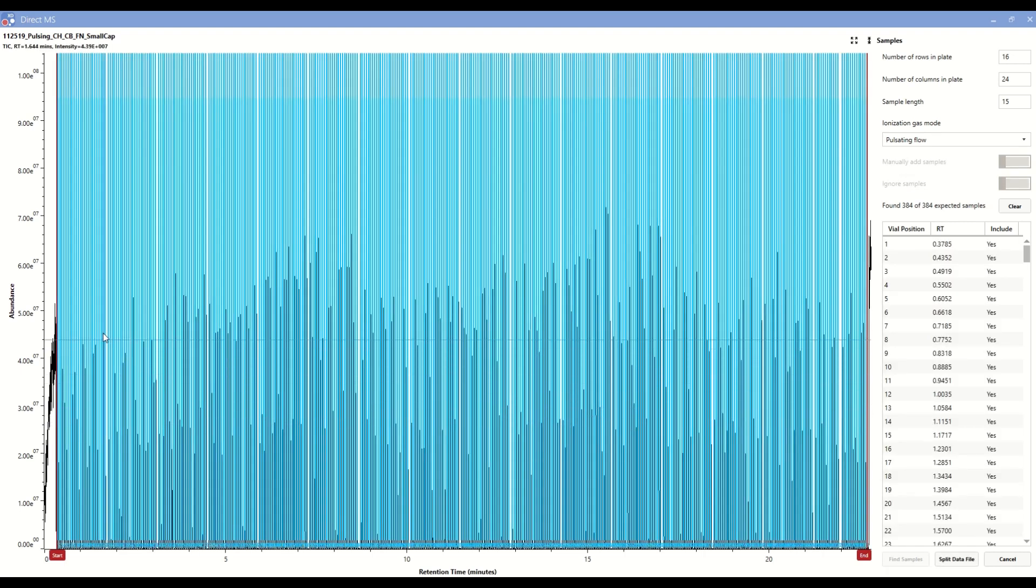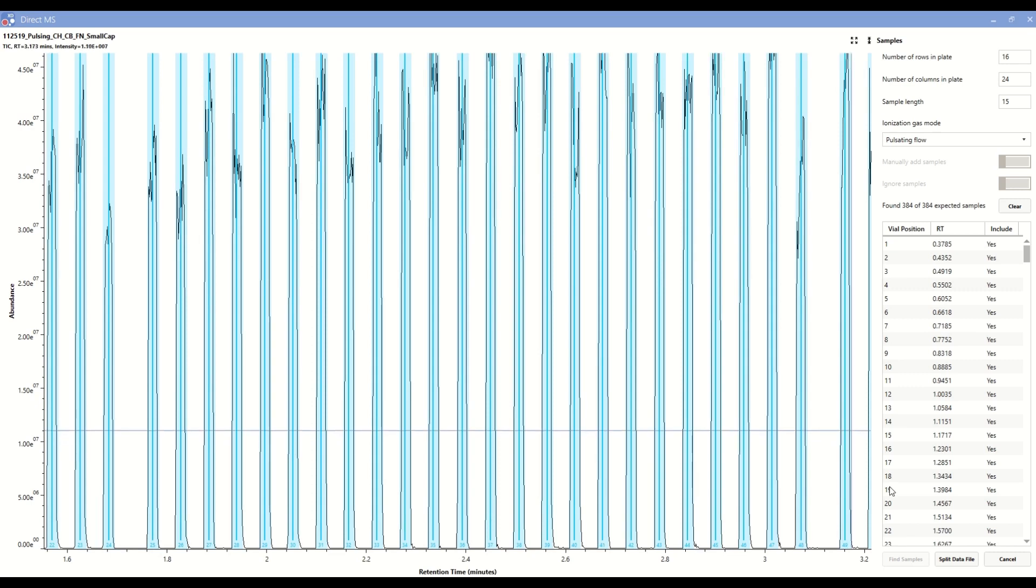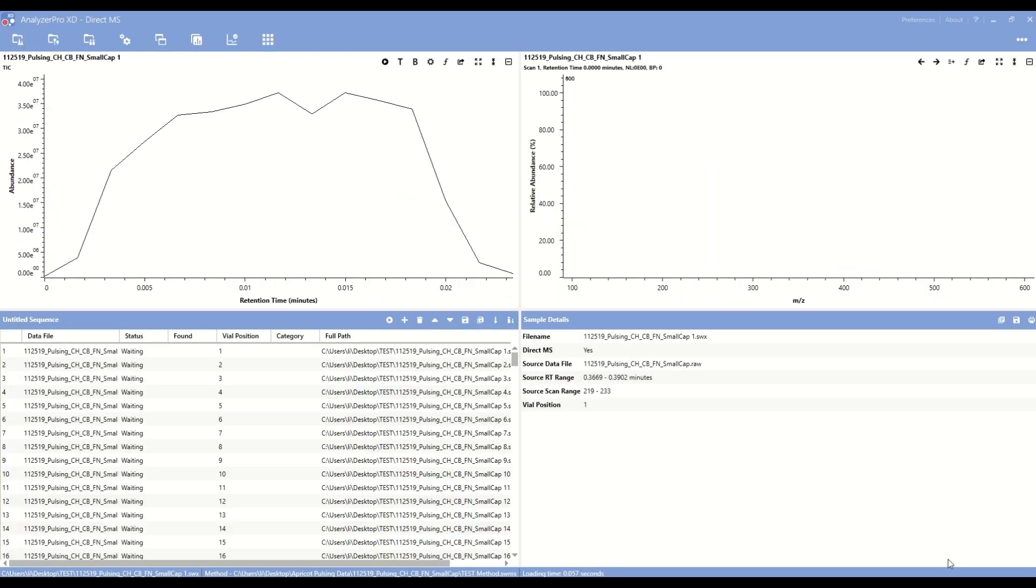Automatic peak detection immediately identifies all 384 peaks and will parse each sample into separate data files. Once the data files are parsed, they can be quickly processed and further interrogated.